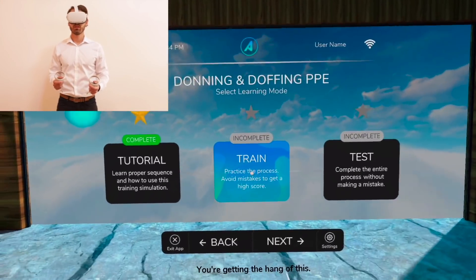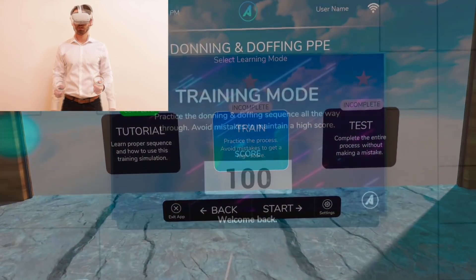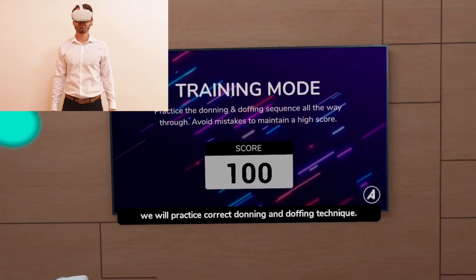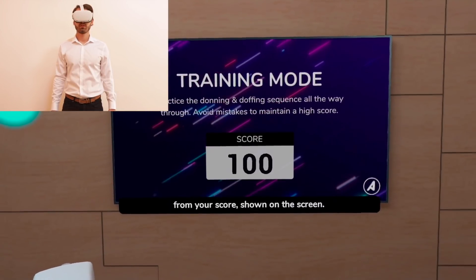You're getting the hang of this. To continue your path of learning, please select the training mode. In training mode, we will practice correct donning and doffing technique. If you make a mistake, points will be subtracted from your score, shown on the screen.